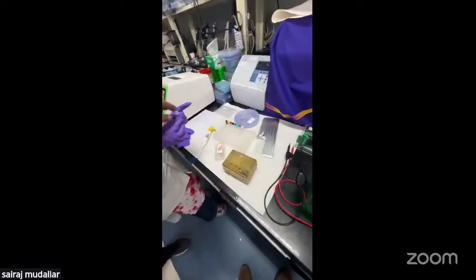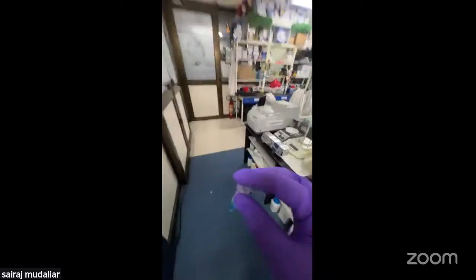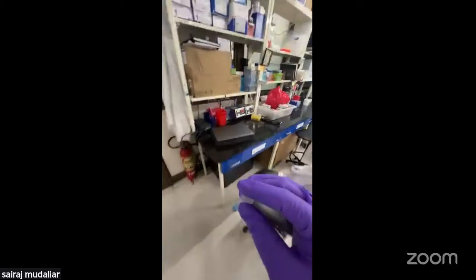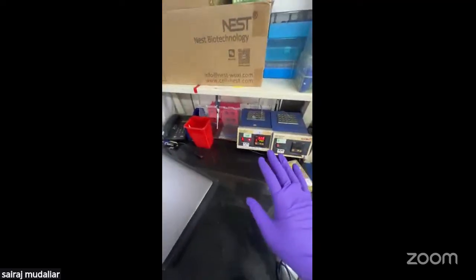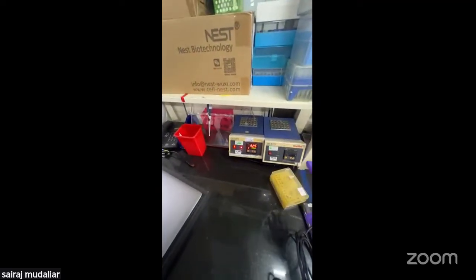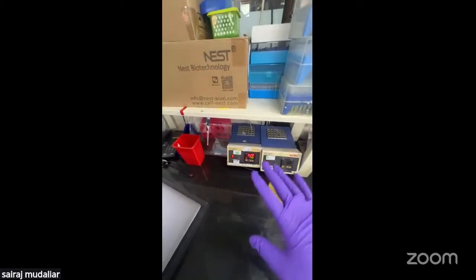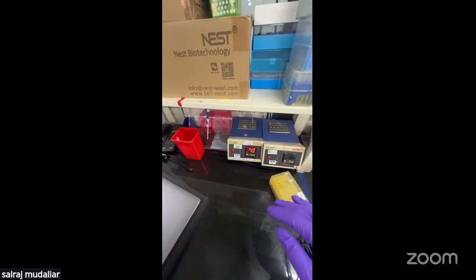We'll take the sample and incubate it in the hot air bath for 4 hours. During this process, the trypsin goes and cleaves the proteins which are present in the unfolded state, which results in the formation of the peptides.